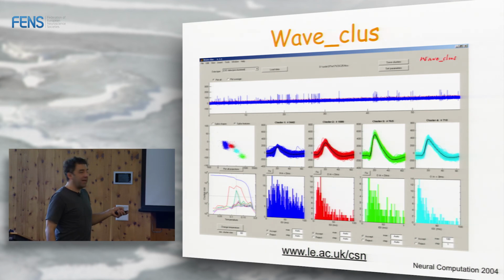If you plot the ISI distribution, so the time in between spikes, right? If I get this cluster and I plot the ISI distribution, you see that there's a little gap here. And the number that the code gives you here is how many spikes you have firing within less than 3 milliseconds. Because if you have too many spikes firing within less than 3 milliseconds, this is a sign that you made a mistake.